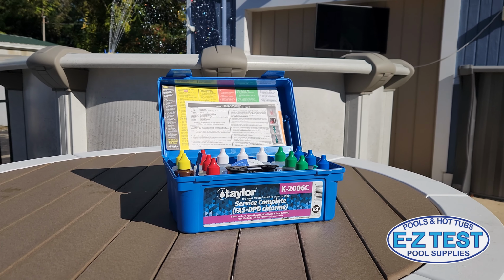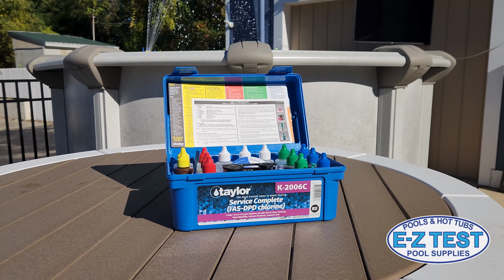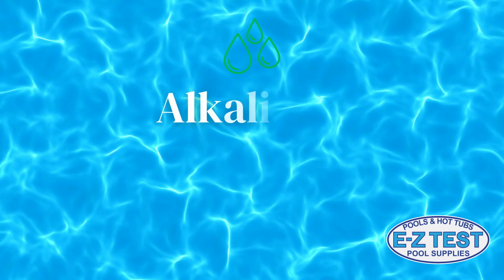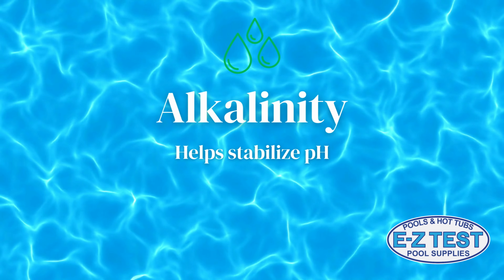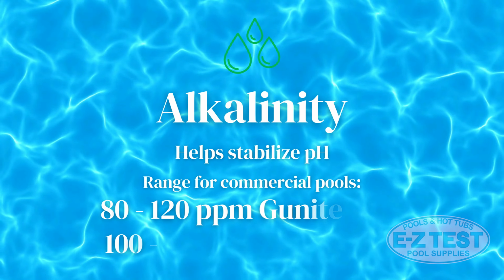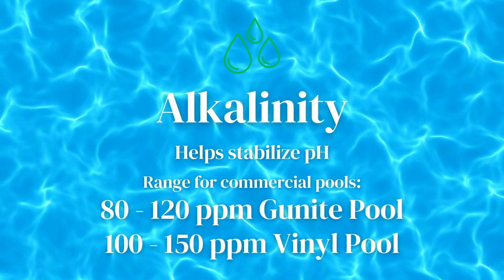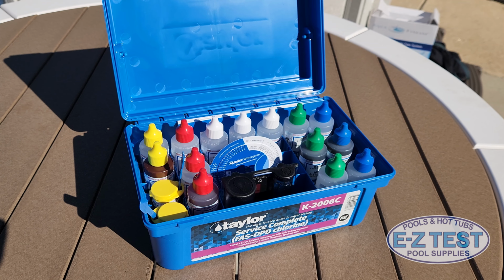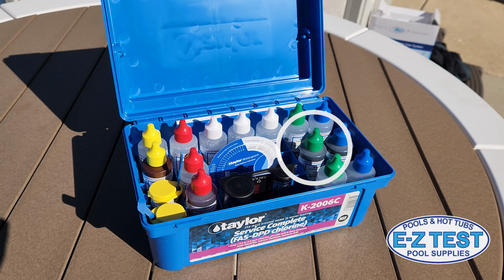In this video, we'll break down how to test for total alkalinity using the Taylor K-2006C Test Kit. The ideal alkalinity range for most commercial pools is 80 to 120 parts per million for a gunite pool and 100 to 150 parts per million for vinyl liner pools. The bottles for testing alkalinity will have green caps.